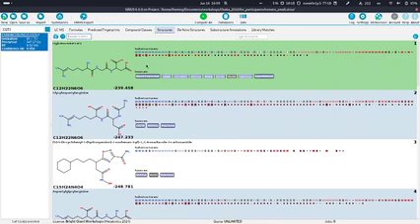So again, always look through all the different views. I mean, it would require really heavy rearrangements to let all the nitrogens cleave off and not other atoms. So that's really unlikely. Okay. Let's go to some other examples where you should be a little bit careful.